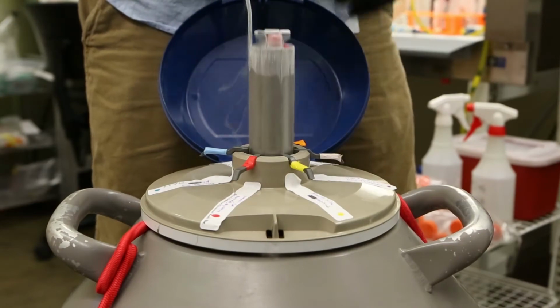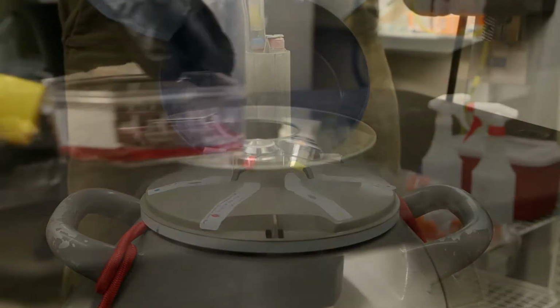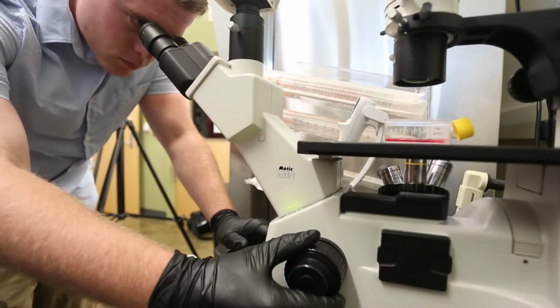One of the major focuses of our lab is studying pain pathways and understanding basically how drugs that modulate pain pathways work. To do that, we either can use tissue culture or we can use cell lines to actually study how the drugs are interacting with the cells. As we bring the cells up out of liquid nitrogen, for example, we will put them into culture flasks, and then we will literally give them artificial blood, so to speak, and media to grow.